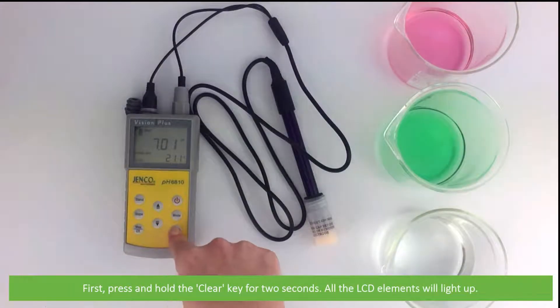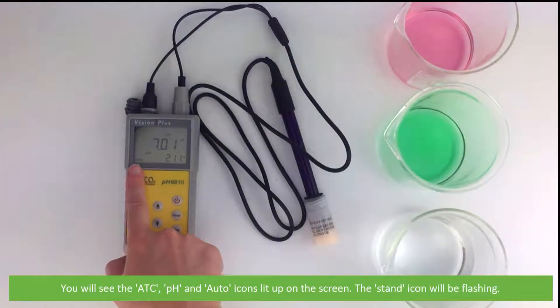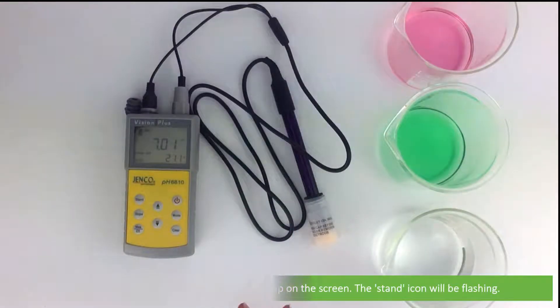First, press and hold the clear key for two seconds. All the LCD elements will light up. You will see the ATC, pH, and auto icons all lit up on the screen. The stand icon will be flashing.